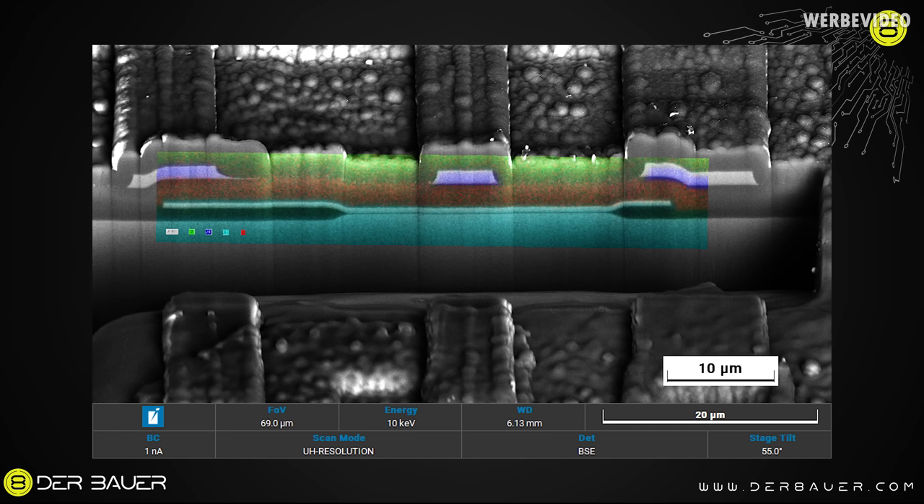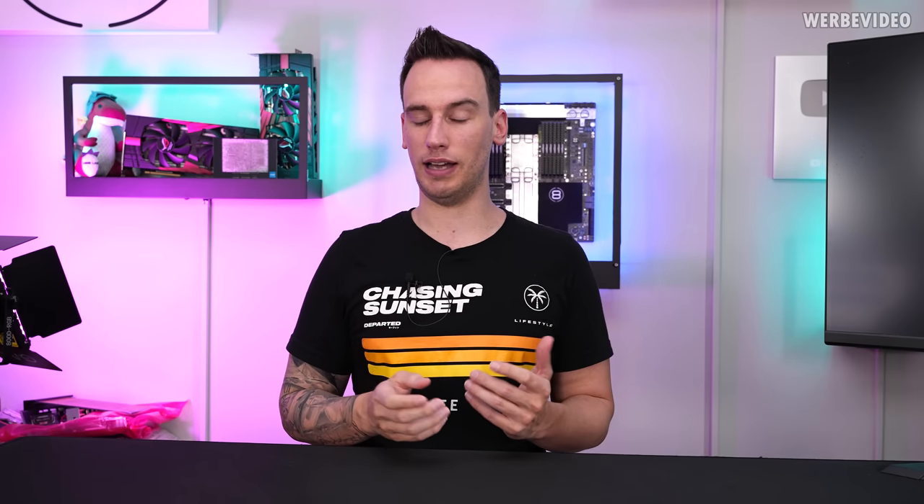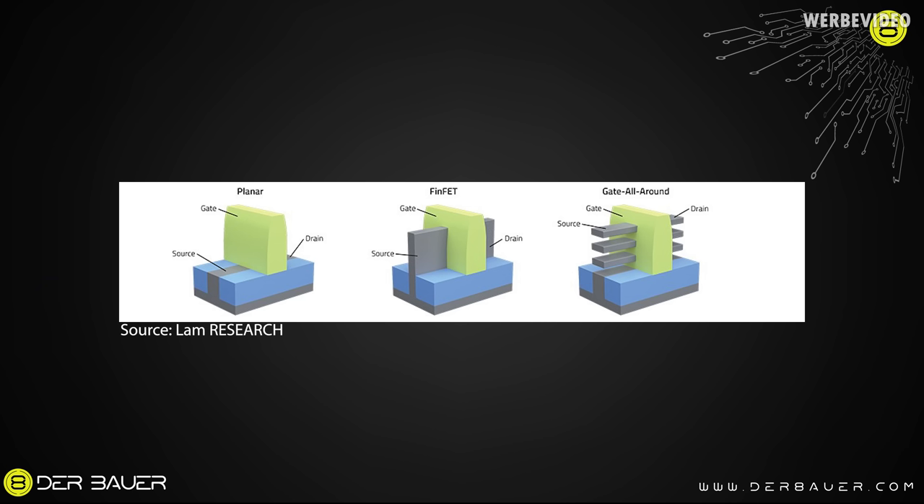If we look at this last image, it shows a trace of the Intel 4004 with a width of about 6 micrometers. Already, that is about 4 to 5 times smaller than the length of the gate of the transistor. On this width of 6 micrometers, on a modern chip you would have about 200 to 300 entire transistors. But we cannot simply compare them, because what we just saw was a 2D planar transistor, whereas nowadays you have much more evolved technologies like FinFET transistors and, for the future, gate-all-around transistors — everything is 3D. You cannot just compare a width with an amount of transistors or how complex they are built.